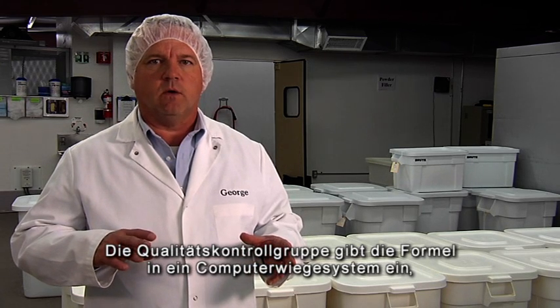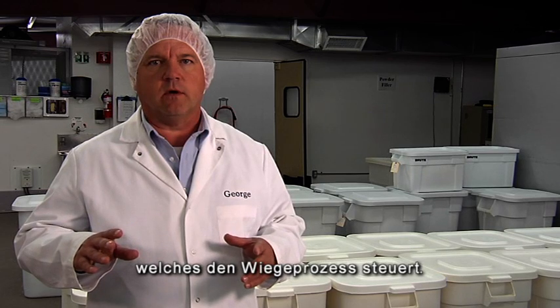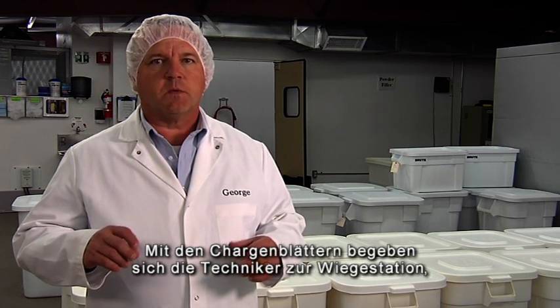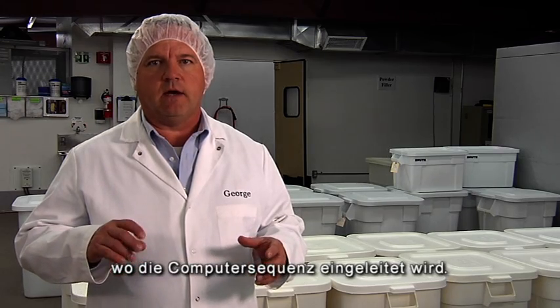The Quality Control Group also enters the formula into the computerized weighing system, which completely controls the weighing process. The operators will take the batch paperwork, go to the weighing area, and initiate the computer sequence.